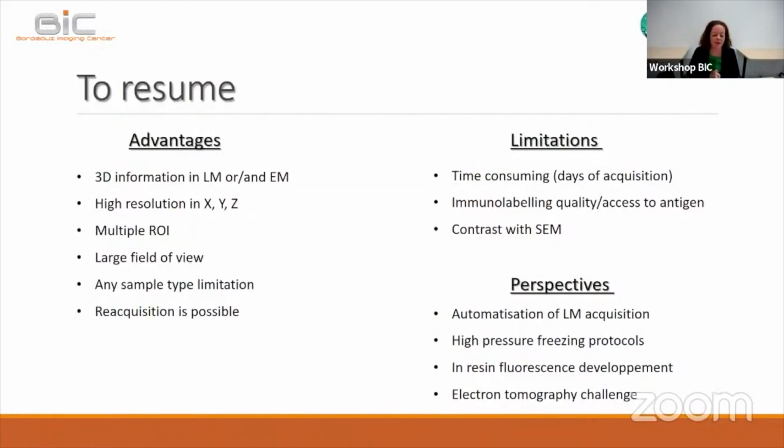To resume, the advantage of this technique is to collect 3D information in LM and EM, so either both or just one. So it's a very interesting tool to have 3D and to explore high resolution information.